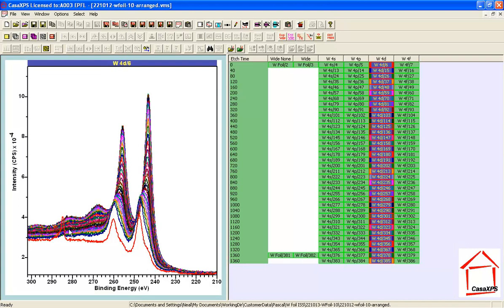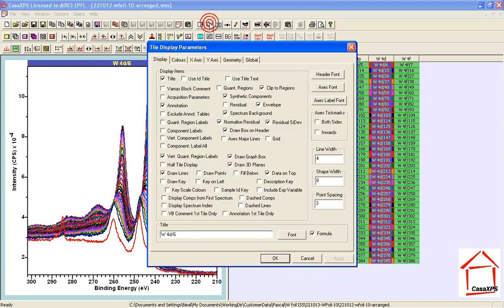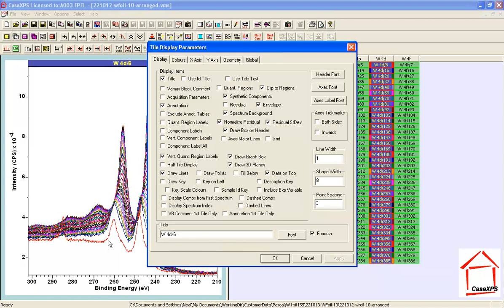Before proceeding with the analysis I'll make some adjustments to the display state. The first adjustment is to change the line width — I've reduced it because the line width alters the rate at which spectra can be plotted, so a narrower line width means that the refresh rate is quicker. I press apply and then I see the narrower lines and the quicker refresh rate.